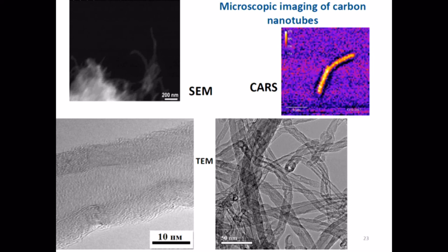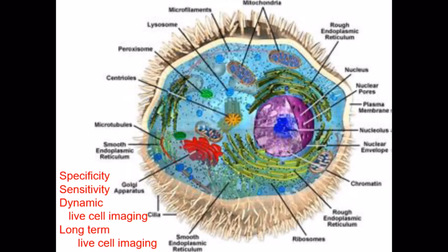This is non-destructive, and there is no need for vacuum or any other thing, but you can image it easily with CARS, coherent anti-Stokes Raman spectroscopy. Yeah, this is one of the classic images from Raman, about live cell imaging, again from the coherent anti-Stokes Raman imaging process. You can image everything, insulating, conducting, bio or any media material.